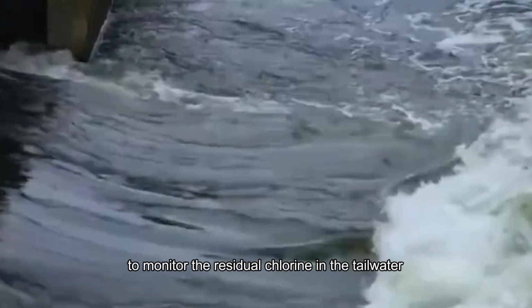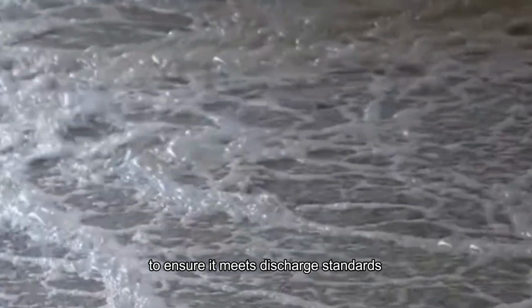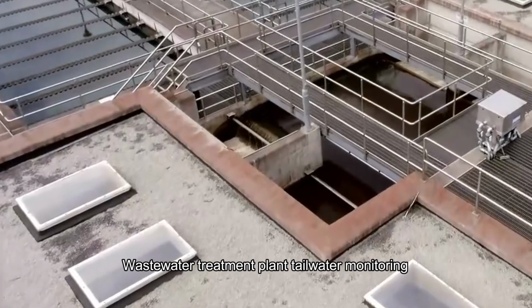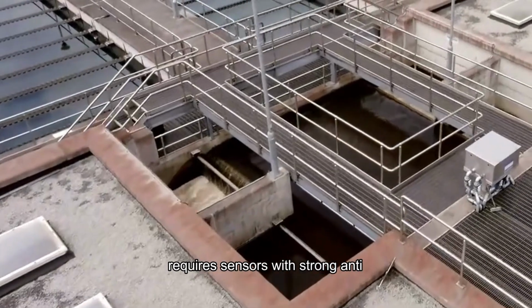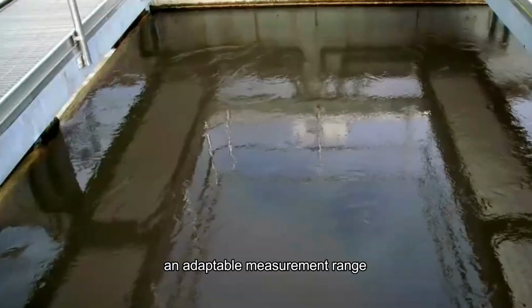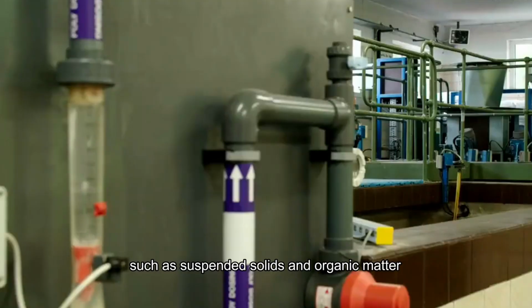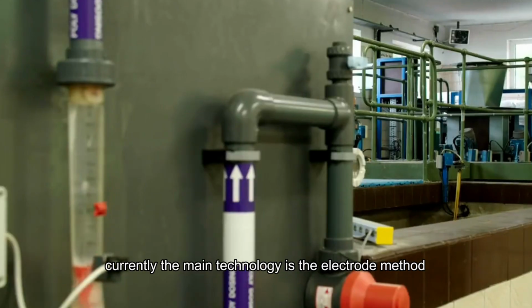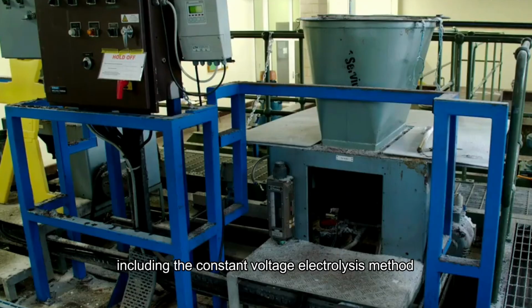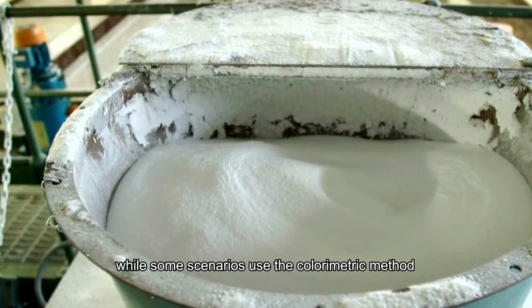Sensors are needed to monitor the residual chlorine in the tailwater to ensure it meets discharge standards and trigger dechlorination when necessary. Wastewater treatment plant tailwater monitoring requires sensors with strong anti-interference capabilities and adaptable measurement range, as the tailwater contains impurities such as suspended solids and organic matter. Currently, the main technology is the electrode method, including the constant voltage electrolysis method and the membrane electrode method, while some scenarios use the colorimetric method.